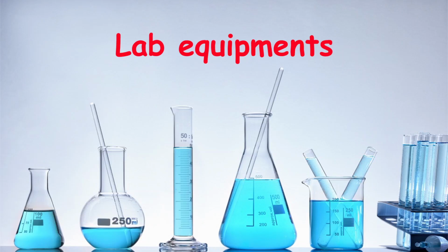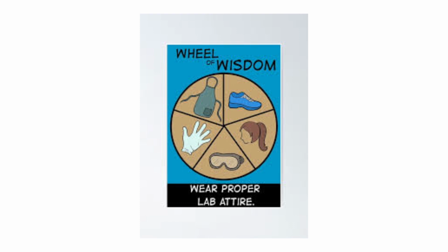Hello everyone! In this video, we're going to discover the different lab tools and the use of each. Let's start. Before entering the lab, there are some safety rules to follow.